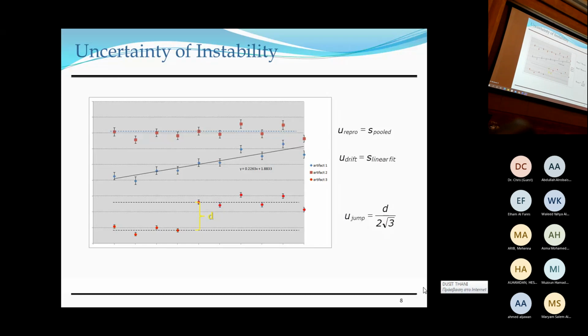This is one possibility. There are other possibilities also, but I think this is the most fundamental. You use your data in order to obtain information with regard to your measuring system. So in this case, you use all of these repeated measurements that you've done over time, and you determine the drift quantitatively by fitting a straight line and finding the uncertainty of the straight line.